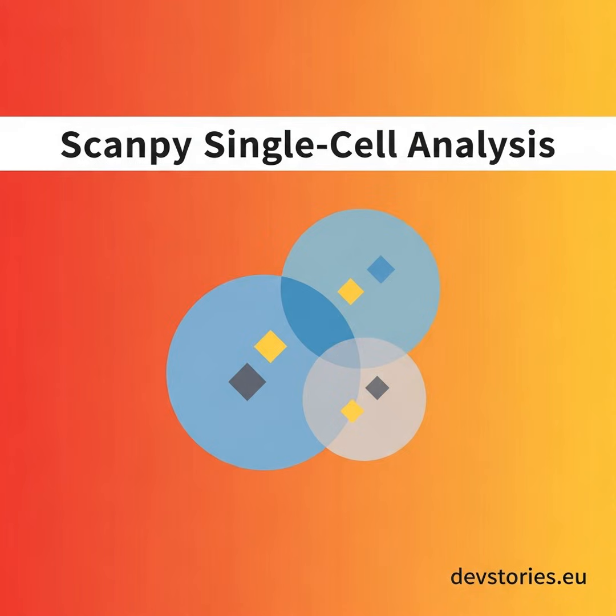Applying this in Scanpy follows a rigid sequence. First, you must compute the neighborhood graph in your object. The diffusion map cannot run without those pre-computed neighbor connections. Next, you call the diffmap tool and pass it your AnnData object. You can optionally specify the number of components you want to compute, which sets the dimensions of the output.